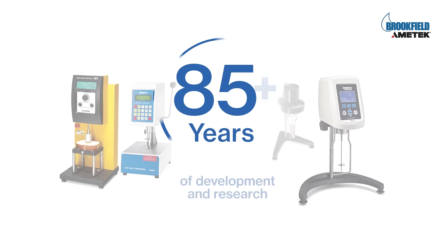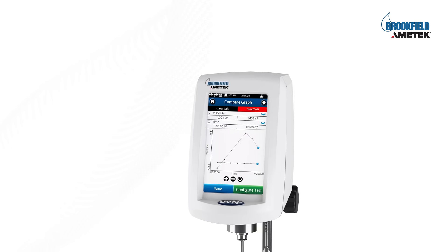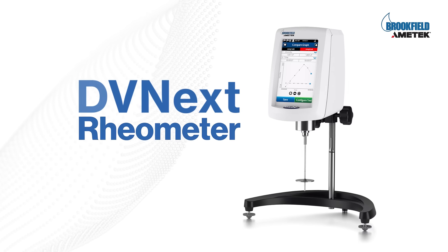Our eight decades of experience would mirror in every feature that is perfected to a tee. Choose quality — choose DV Next rheometer.